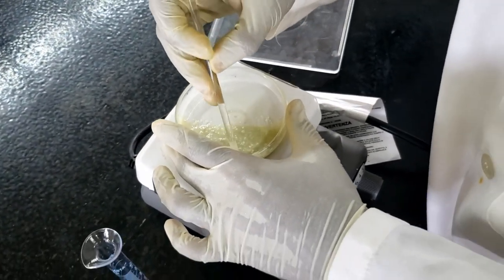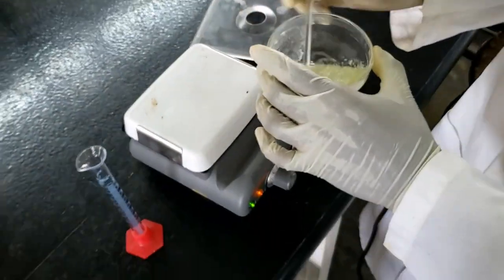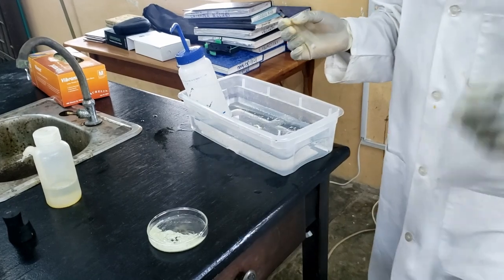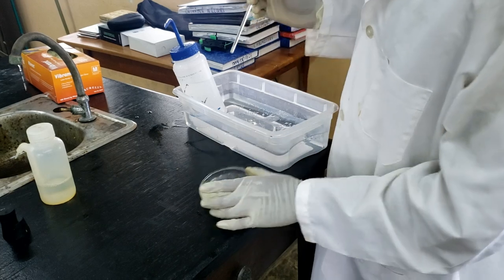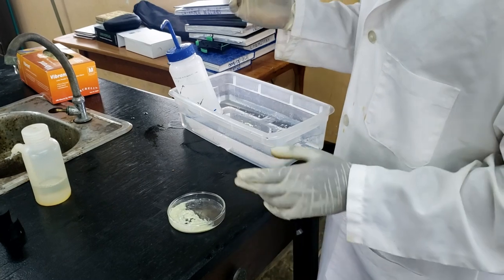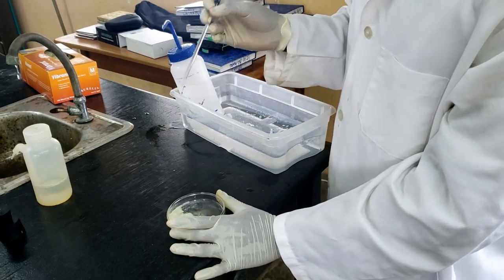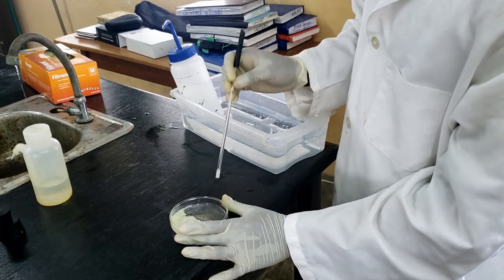And now we move on to cool and recrystallize this over an ice bath. So I have a block of ice here. First, I'll let this paste cool to room temperature, and then I'll cool it down to 0 degrees Celsius on this block of ice before we move on to then recrystallizing and washing again with the vacuum filter. And this time we're going to wash with ethanol instead of water. So I'll just let this cool, then ice, and then wash again.